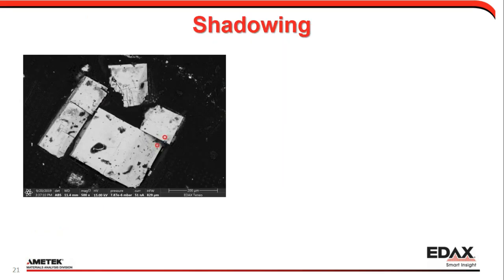These blocky crystals are galena. I analyzed 2 spots on top of them. The upper spot is from the piece that is bumped up, and the lower spot is from the surface that is one step down, and the detector direction is to the top right. So that means the lower spot is in the shadow zone of the piece that is bumped up.